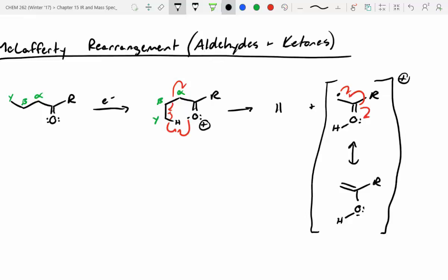I have a question. Yep. When we're drawing those out, is it okay if we only draw out one of the protons? Yeah, for the gamma position, you're asking, do you only have to draw one? Yeah. I oftentimes only draw one, otherwise it gets really cluttered.